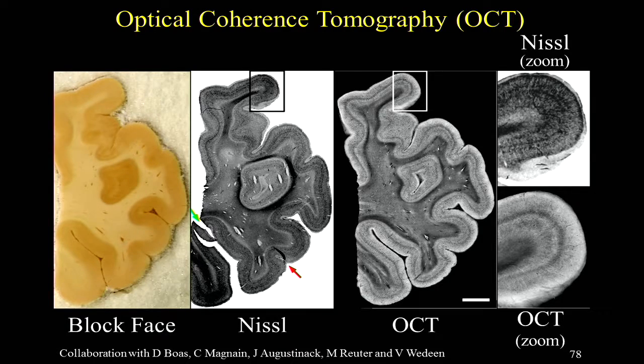We've done a bunch of preliminary studies with the OCT. We've shown that we can essentially extract the same information as a Nissl. So here's a Nissl-stained image. This is an OCT. We can see all 6 cortical layers. We've verified this with an anatomist, Gita Gustanak, who sat down and labeled the layers, both in the OCT and in the Nissl. And they're essentially in the same place, modulo distortions in the Nissl.